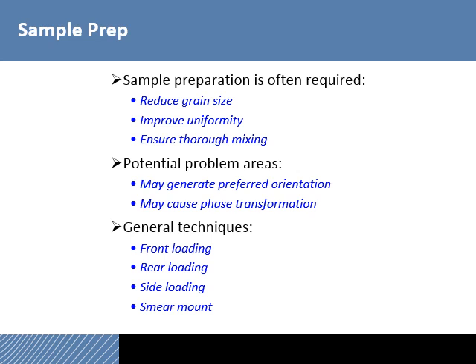And then we'll talk about the general techniques of sample prep: front loading, rear loading. I don't recall actually having a side loading slide in here, but we'll see when we get there. And then a smear mount.